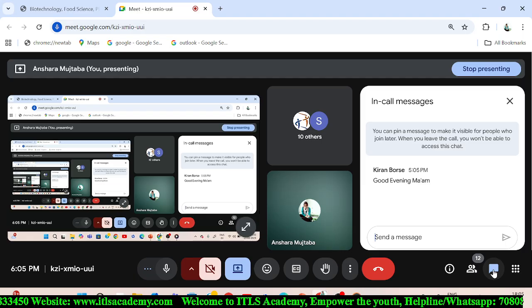Yes, ma'am. So this incubator is for a heating purpose. When we heat it and suddenly decrease its temperature, let's see. Here, you heat it until it reaches 65 degrees Celsius. Suddenly you add that potassium acetate and then decrease its temperature. This means that you give a shock to the cell, and in this way you purify the cell. That's why we incubate it for the purification process.